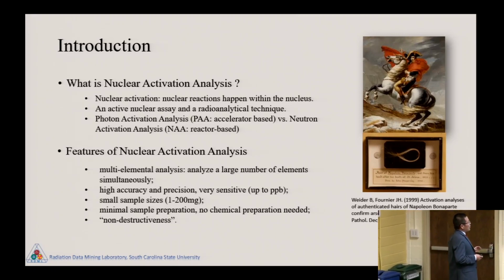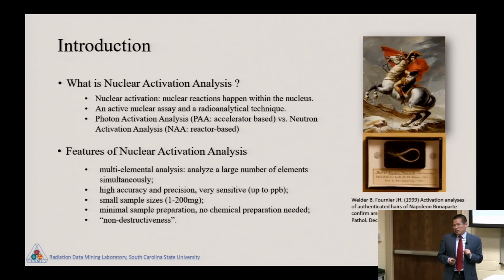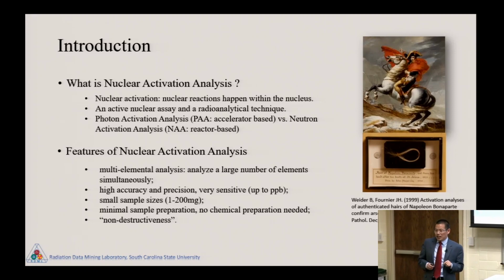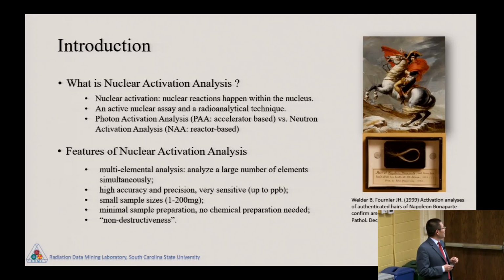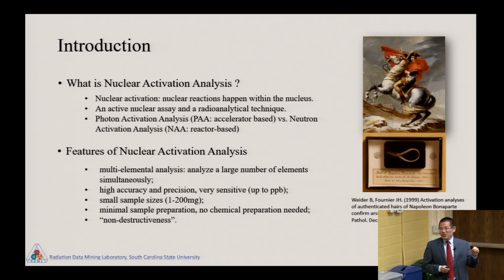Another advantage is called non-destructiveness, which I put in quotes because I think it's not really non-destructive. Nuclear reactions happen there, and you make some new elements. But because your sample is very small, for example, if we deal with artifacts, we only need to drill a very small hole underneath it and get some powder. People usually do not notice that, so we call it non-destructive.